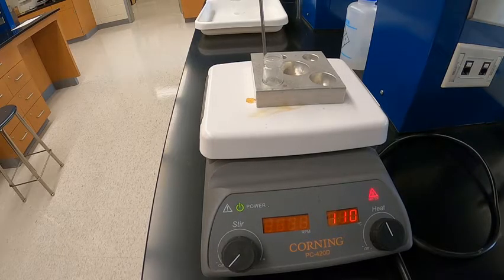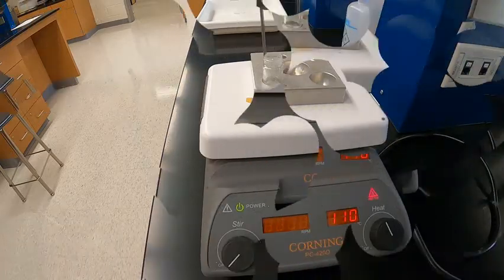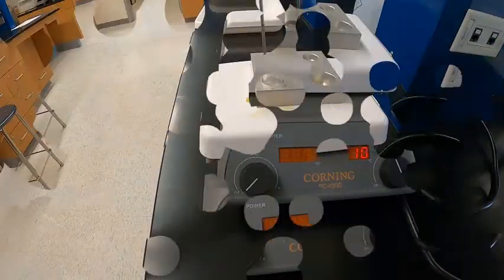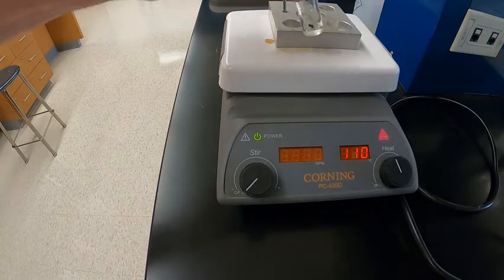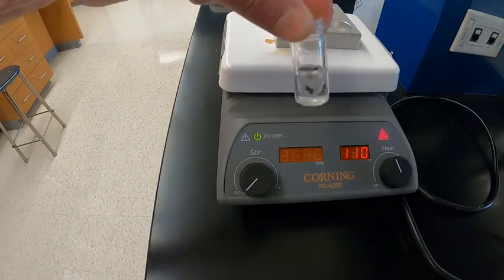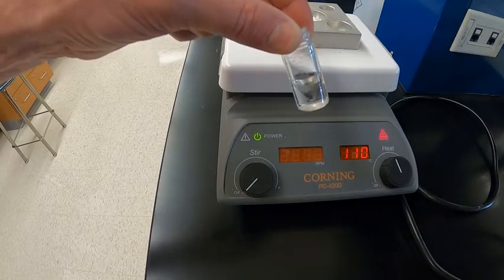So what I'm going to do now is pause and come back in about 15 minutes. The video will keep going. All right, welcome back, everyone. I'm going to let this run for about 15 minutes. Reacted for about 15 minutes. And then come back and show you how to do the filtration step. The hot plate is still going. So now, if you look closely, you can see that everything has dissolved and reacted.